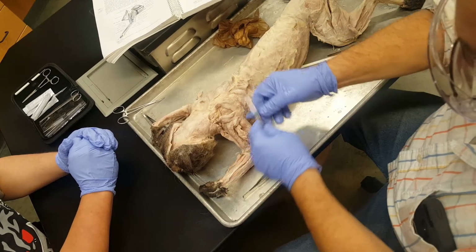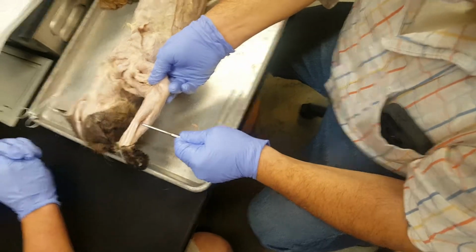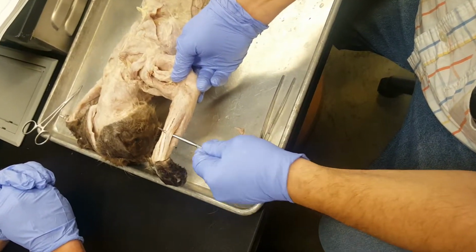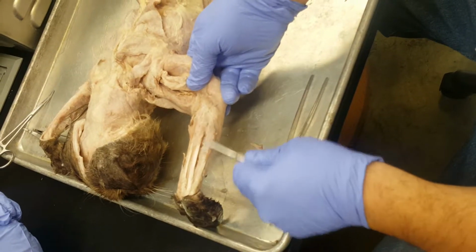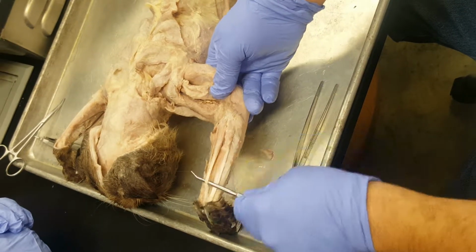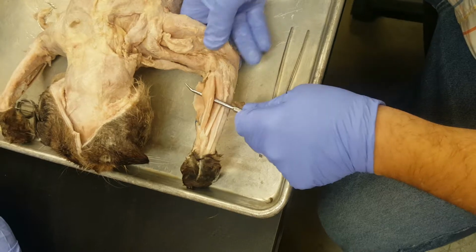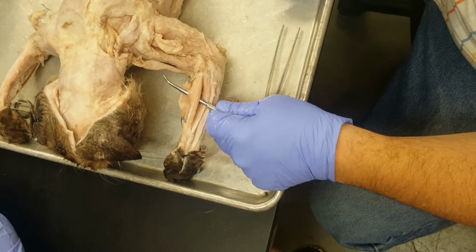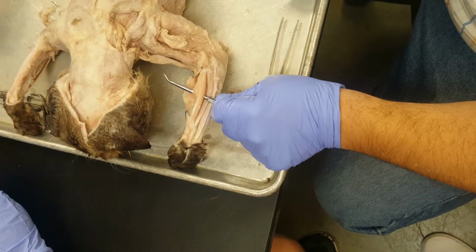Okay, then down on the arm, on the forearm, we got the extensor carpi ulnaris. You got your extensor digitorum lateralis. You got extensor digitorum communis. You got your extensor carpi radialis longus et brevis. So there's two muscles here, the long and the short.